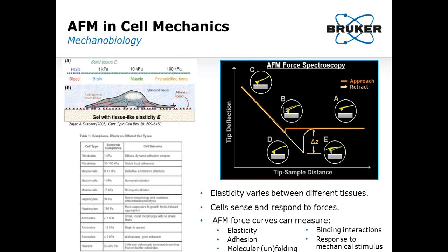A rapidly expanding area of research in cell biology is mechanobiology. Cells are very sensitive to forces in their surrounding environment. Not only can they sense forces, they're also capable of responding to these forces. The resistance or elastic modulus of a substrate felt by a cell, whether that be from a tissue matrix, an adjacent cell, or even a synthetic substrate designed to mimic a tissue surface, directly influences the stiffness of the cell.